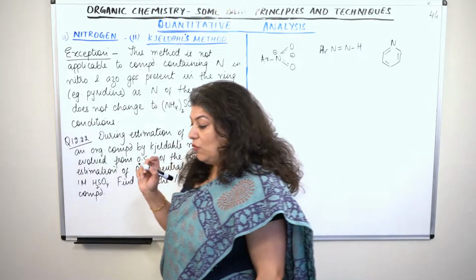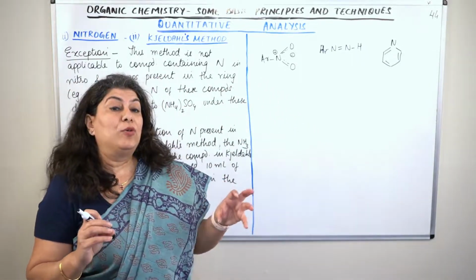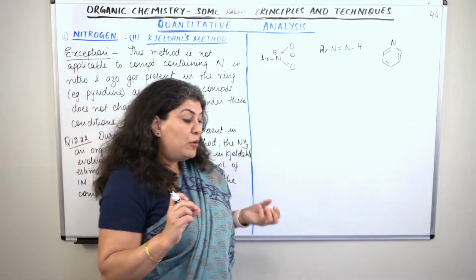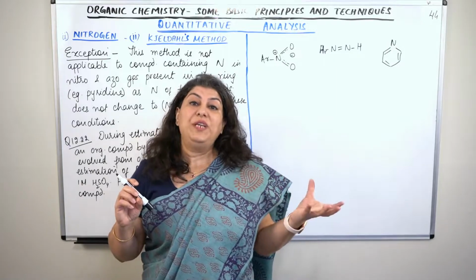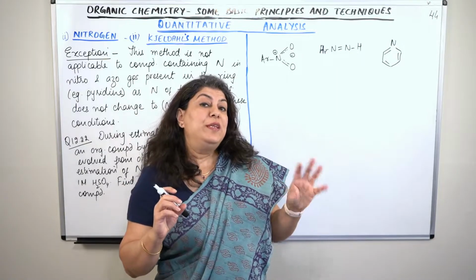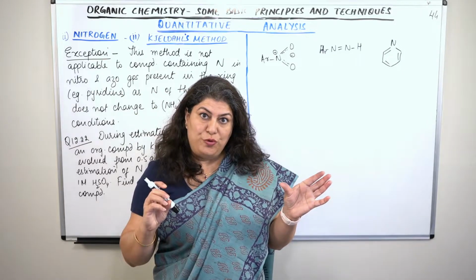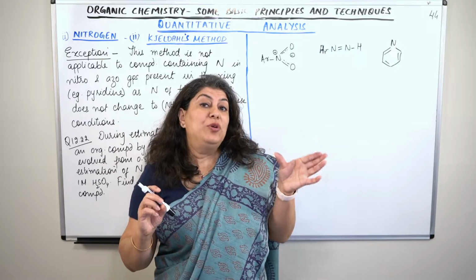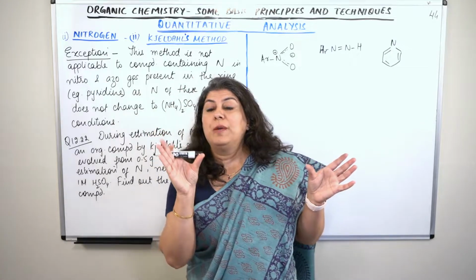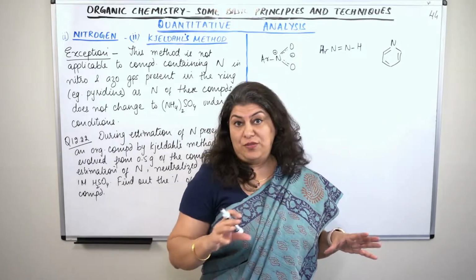Do you remember what we did in the previous video? I told you how we calculate. We find out the amount of nitrogen that was present in the ammonia which reacted with H2SO4. If we know the amount of H2SO4 used from the ammonium sulfate that was produced, then by stoichiometry of the equation, we can know the amount of ammonia that was used.